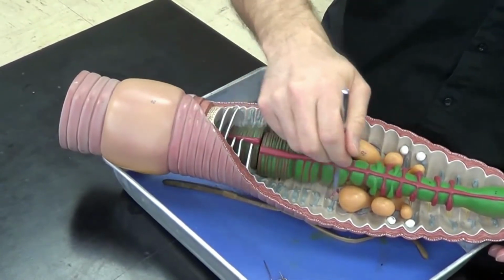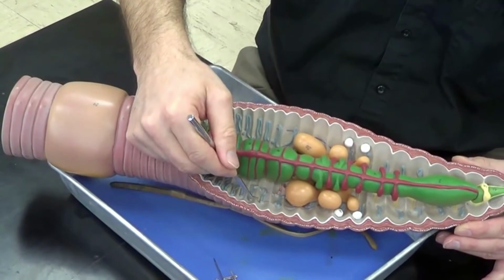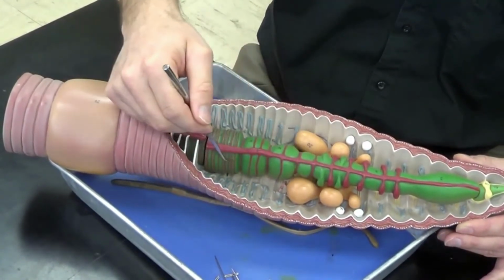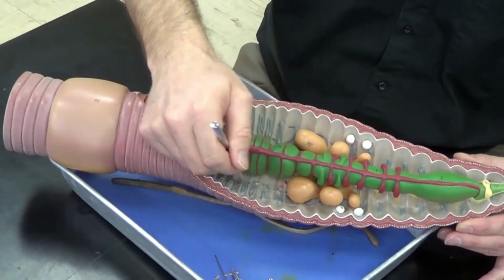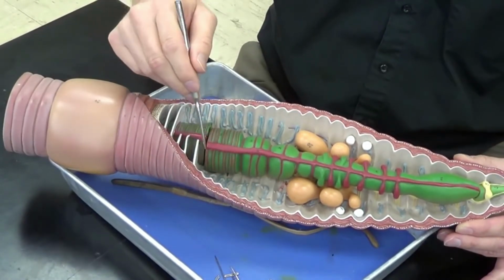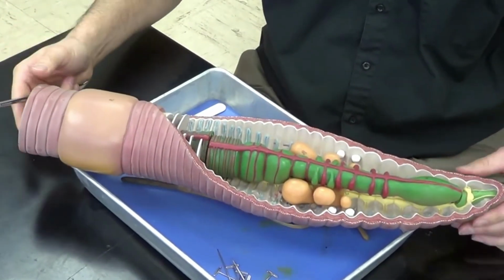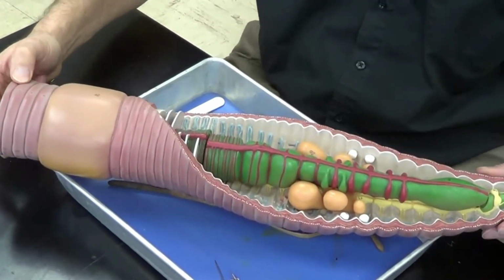Now the actual compartment here, all this space between the wall of the earthworm and the intestine, or the digestive tract of the earthworm, is referred to as the coelom. And the coelom is broken up into segments by these septa. All right, let's go ahead and actually start the earthworm dissection.